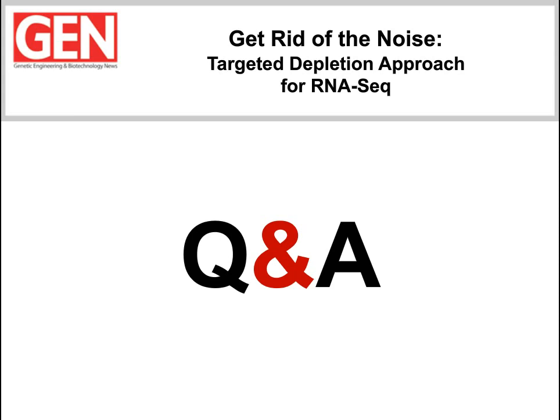Okay, great. Thank you, Ashish. Maureen, another question for you. Can Solo libraries be sequenced on any Illumina platform? Are there any deviations from standard Illumina sequencing parameters?